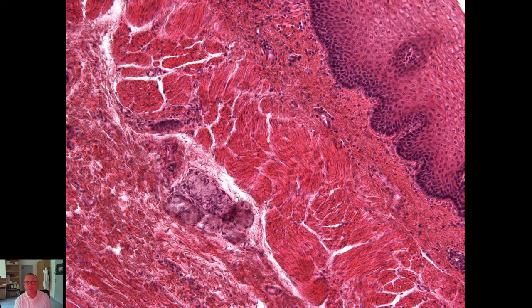This is the picture of the specimen of esophagus, in this case stained with hematoxylin and eosin, so we can see red or pink structures which are stained by red dye, which is eosin here, and we can see violet structures like here or here, which are usually nuclei of cells stained by hematoxylin, a representative of basic dyes.